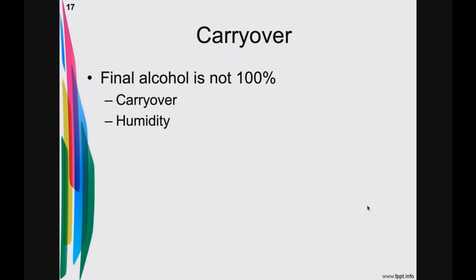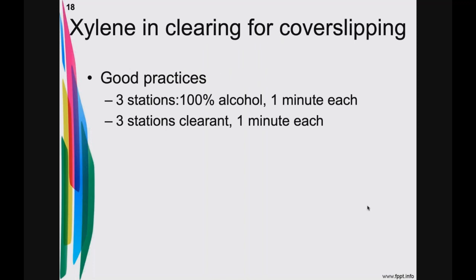So you have carryover. It's due to carryover, and it also could just be due to the humidity in the room. Here in Michigan, probably in another couple of weeks, people are going to start having problems that their 100% is not staying 100% because of the humidity in the room. It changes their 100%. So you've got to be careful there.